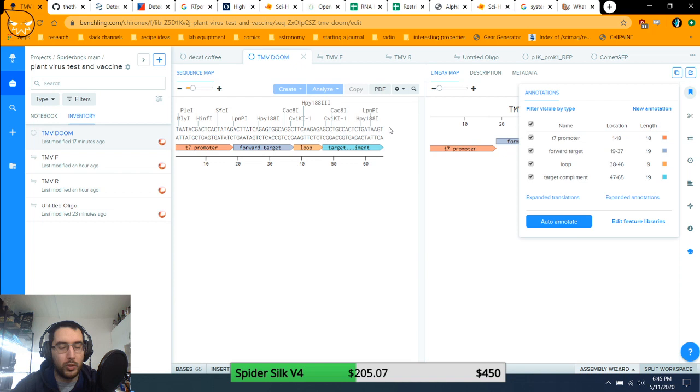I could take that raw extract and mix in this piece of DNA and it should make RNA, with one caveat: I don't have the letters to fuel this reaction. I'm literally missing one of the components. But if only there was an enzyme, which I happen to have a vial of in my freezer, which could cut complete RNA apart into the individual letters, that would solve my problem, wouldn't it?